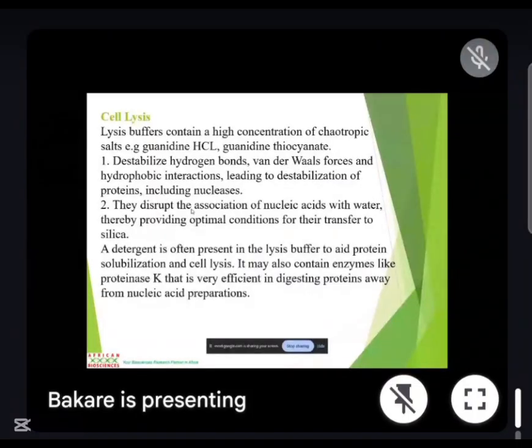It's cell lysis. So imagine ourselves now that we want to extract from a blood sample. We already take our 50 microliters of blood inside a 2 ml microcentrifuge tube, and we are using the Gene Aid genomic DNA kit. The first thing they will ask us to do is to take the blood, that volume of blood inside a tube.